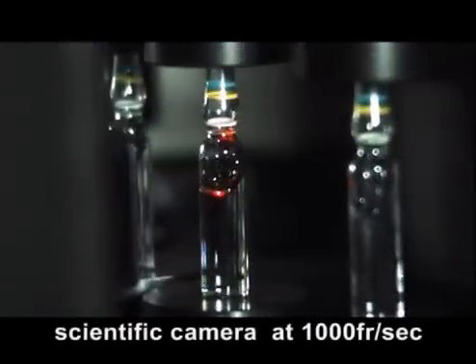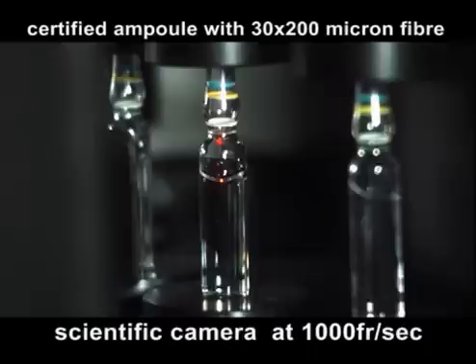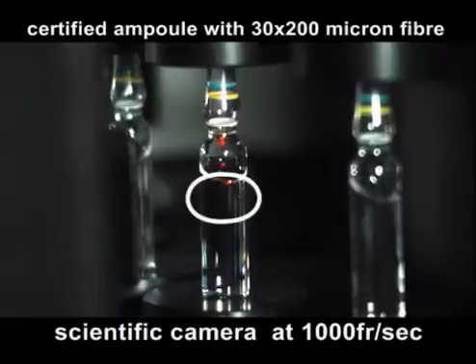This vision and verification system utilizes appropriately sized prisms and allows for observation of the same ampoule from two different angles, performing two inspections for each video camera, thus doubling inspection capacity.